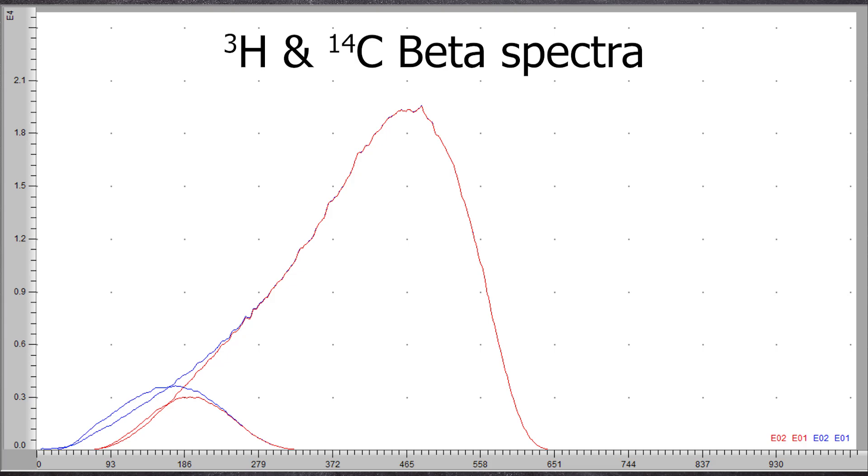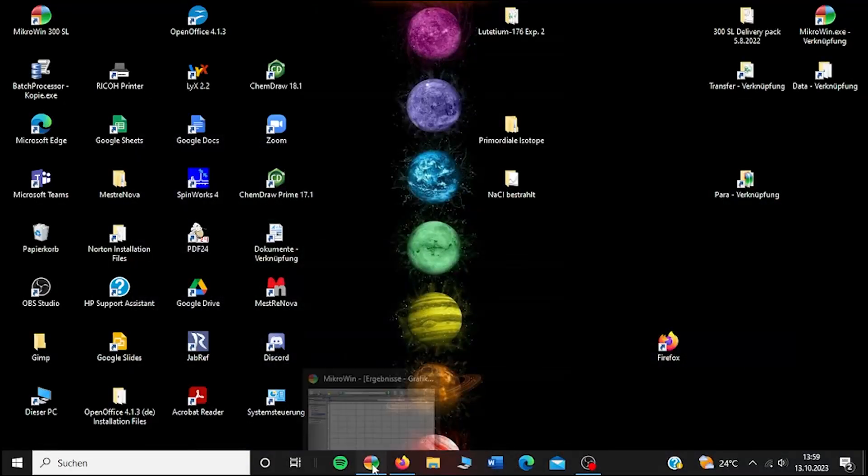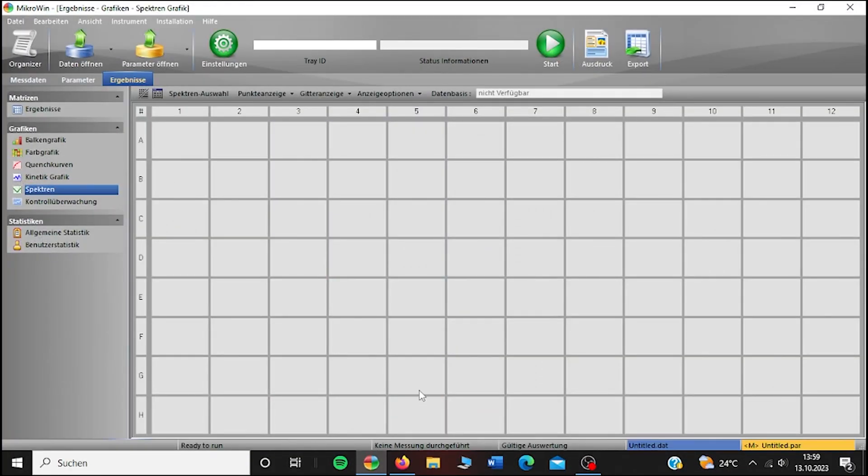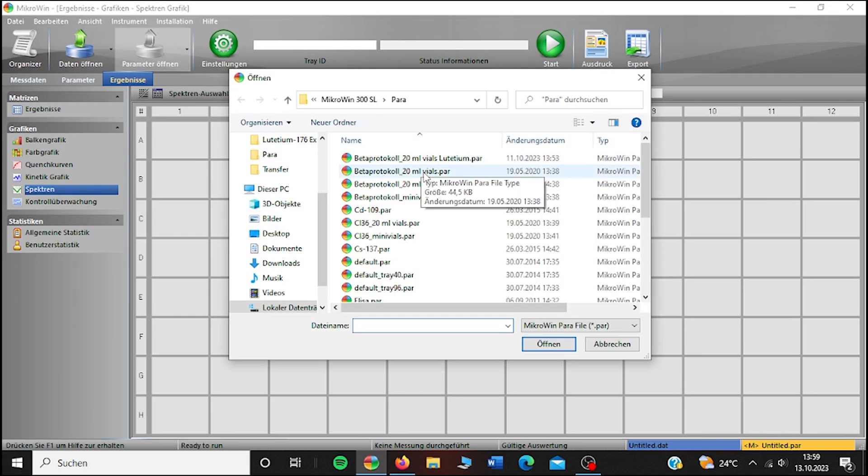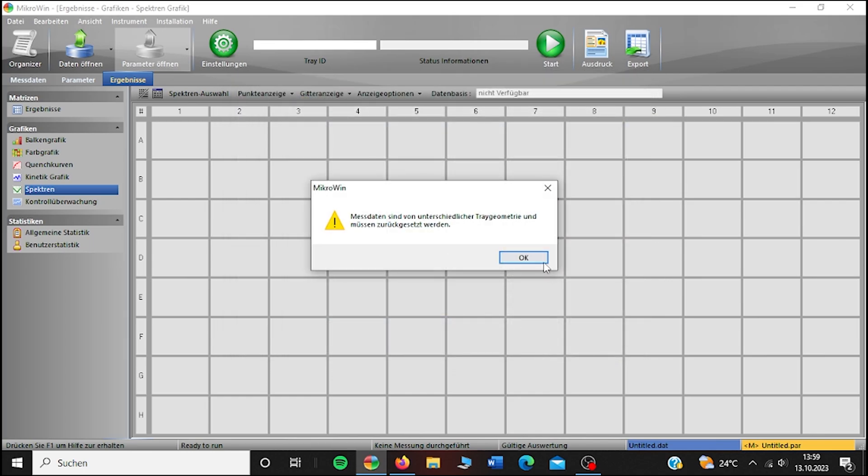Now, this part is only important for those who really want to understand how to operate this device and learn about the effects during the measurement. How do you start this measurement? The software is called Microwin. First, a parameter must be selected. This parameter gives the device a rough idea of what kind of samples are in there. For example, is it a 20-milliliter vial or a 5-milliliter vial?